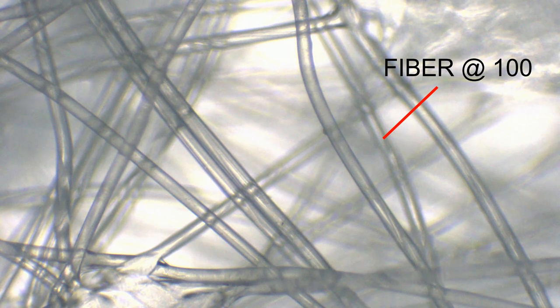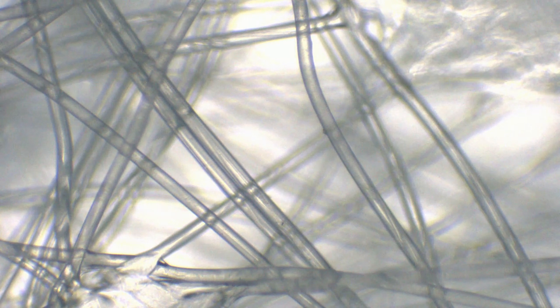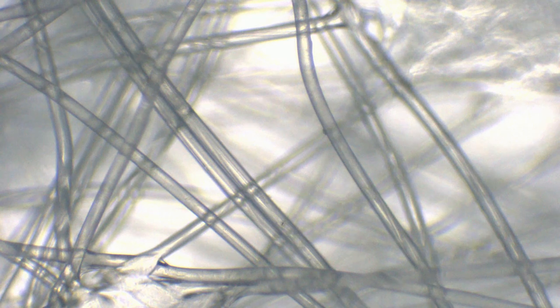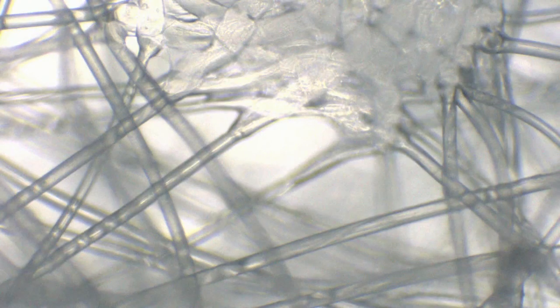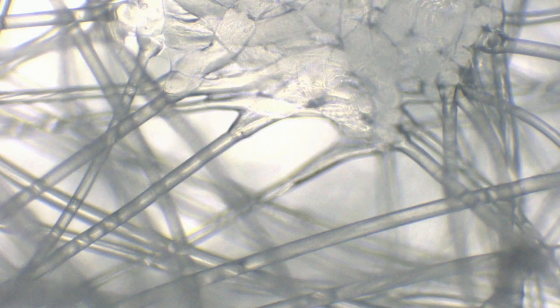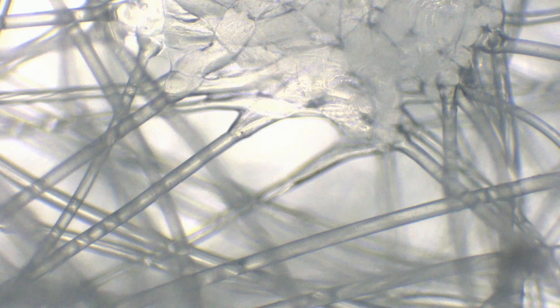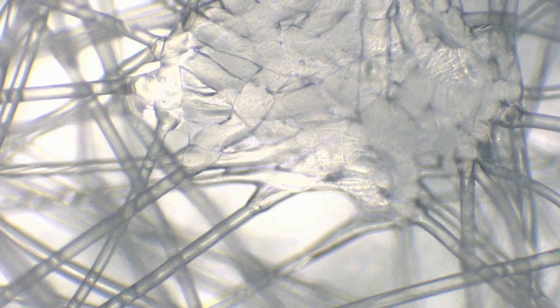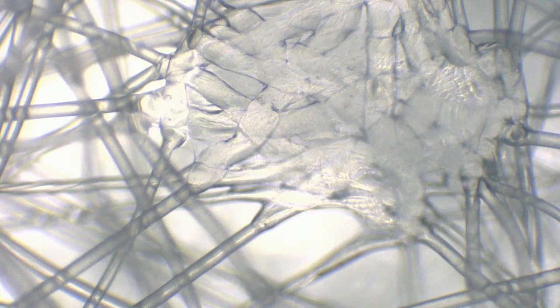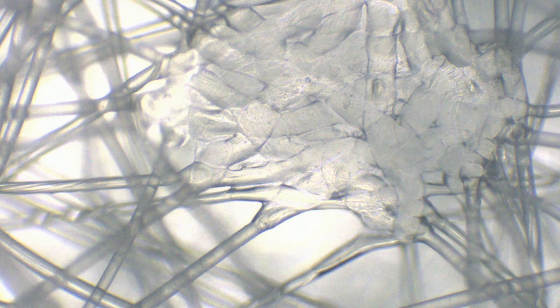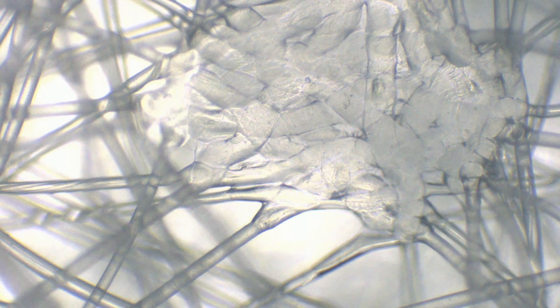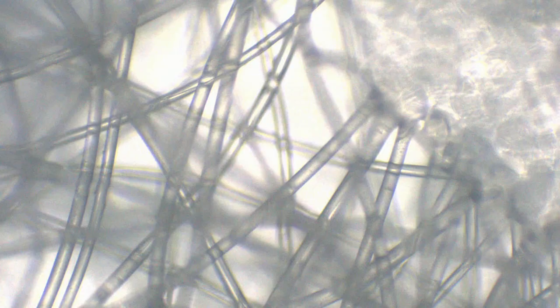You can see in this portion all the fibers are stuck in one place. These are normally synthetic fibers used for making masks. You can see all the fibers are stuck at one place so that the fibers don't move around and the dimension remains almost constant.